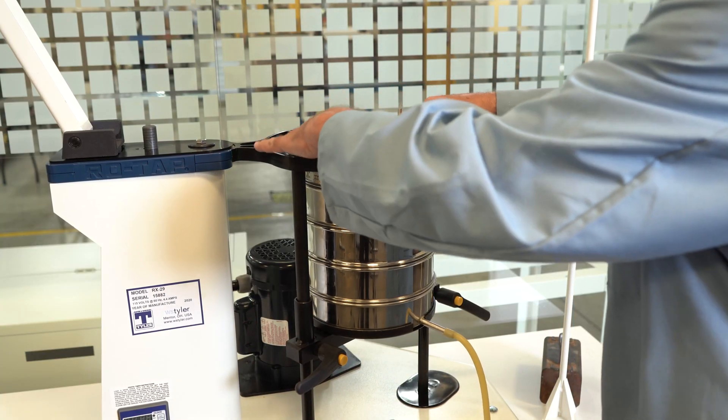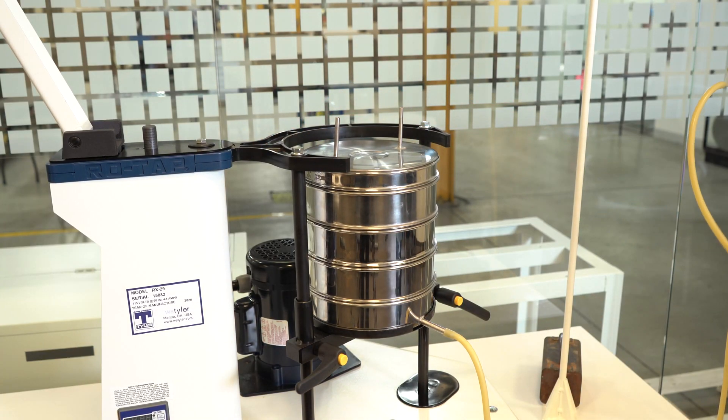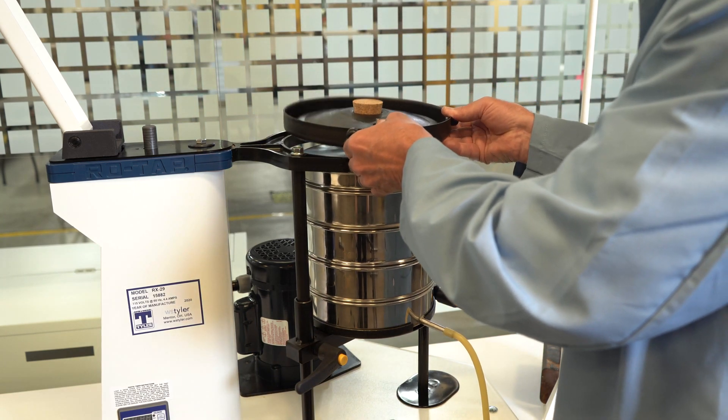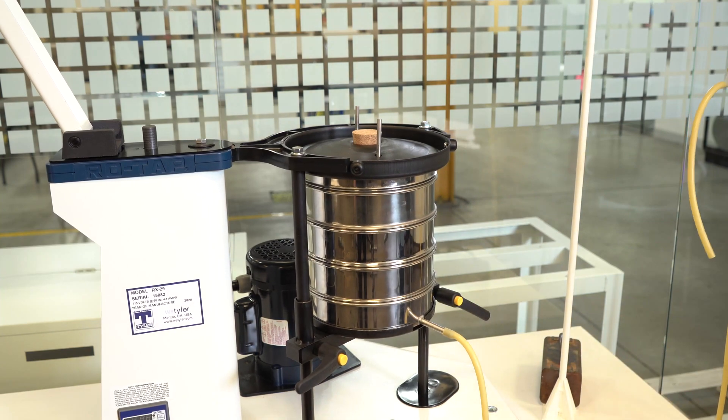Step nine: place the sieve cover with inlets on top of the sieve stack. Step ten: place the modified sieve cover over the sieve cover inlets and secure the stack in the shaker.